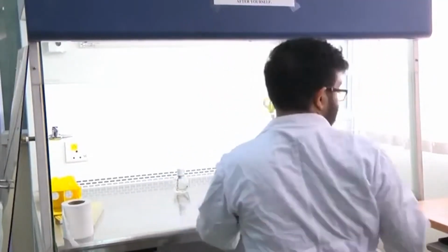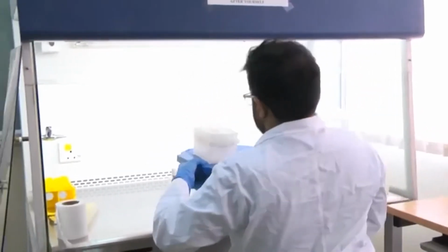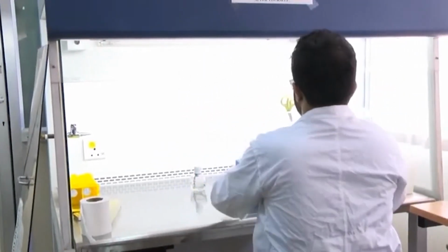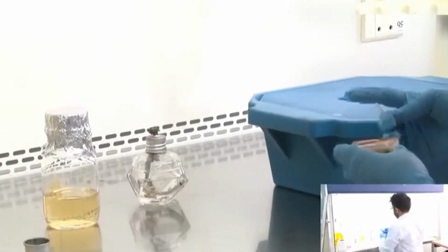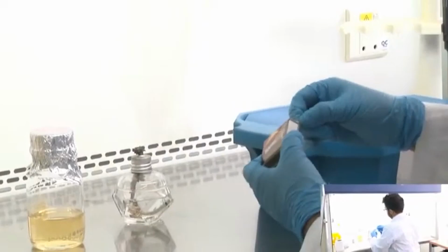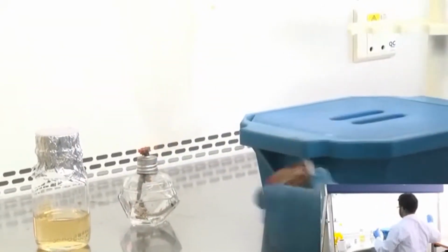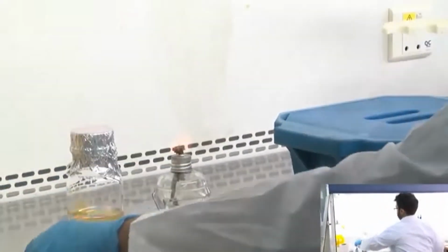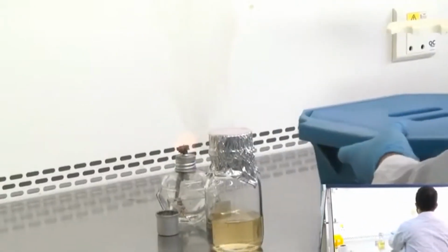So, now that I have wiped it, I am going to take the things that we need for the experiment, and turn on the burner, just to create a sterile zone here.